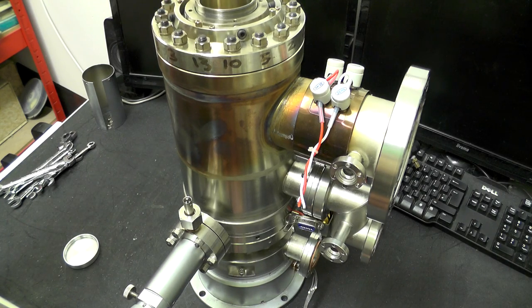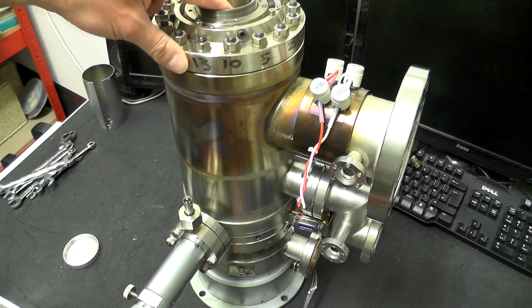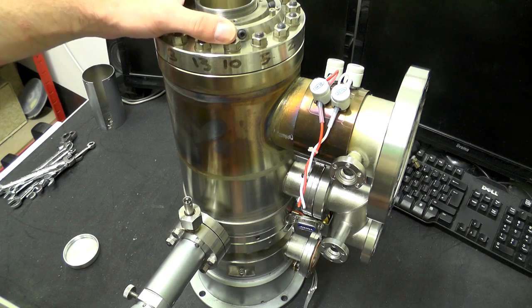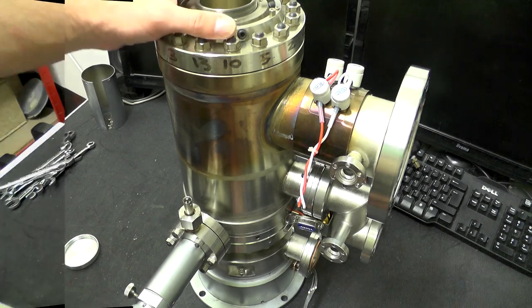You'll see more of that in detail when I take it to pieces. The electron gun I believe is made up of a tungsten filament — a tungsten wire.